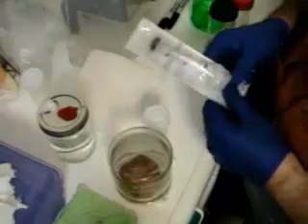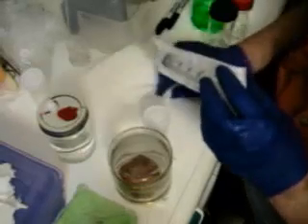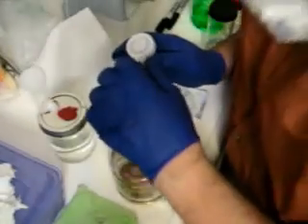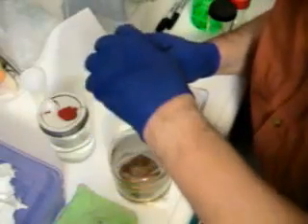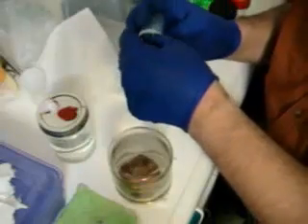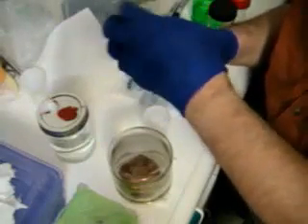New syringe — although it doesn't have to be new, it just has to be sterile. That alcohol is strong. You want to be wearing a mask and gloves because you can breathe all kinds of contaminants into your project if you're not careful.